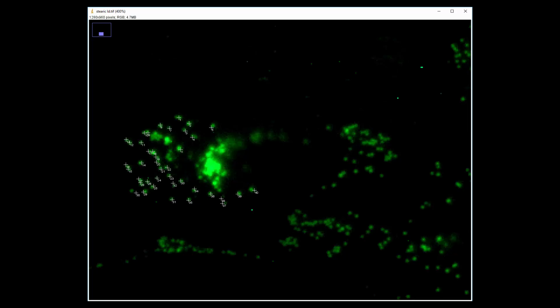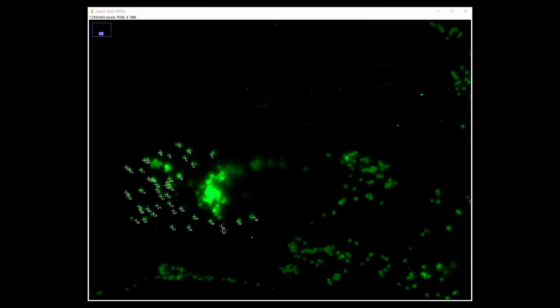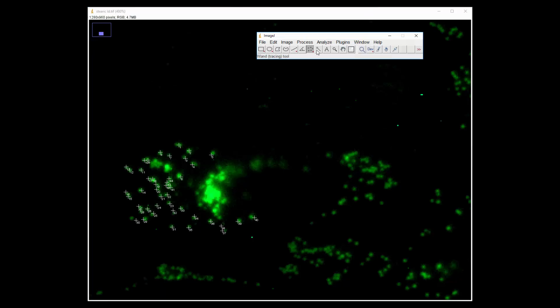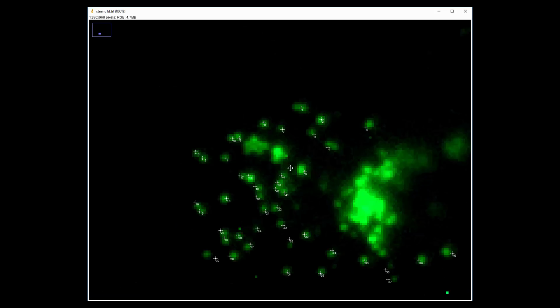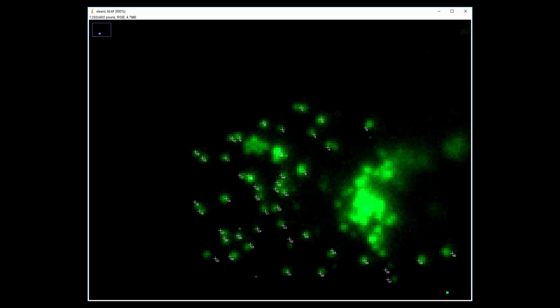All right, and then these, you might have to zoom in deeper, right? And that's okay. So if we want to zoom in deeper, and we're like, I really don't know if that's a spot, if that's a location or not, we can zoom in even deeper. And you can start distinguishing what's a lipid droplet and what's not. Sometimes it's a little easier than others, but I would classify that as 2 there. And then, at this level, we can start distinguishing what's what here.